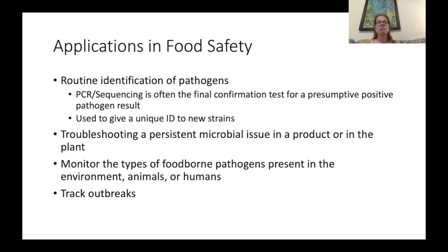Then sequencing is very helpful as you begin to work towards eliminating that strain from your environment, to determine number one if you've eliminated listeria in general, but number two if you've eliminated the strain that you're most concerned about, which is that persistent strain.